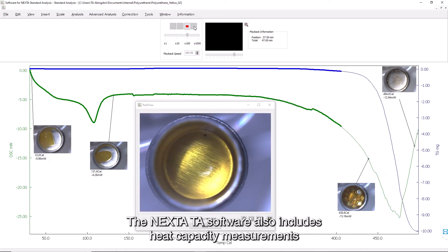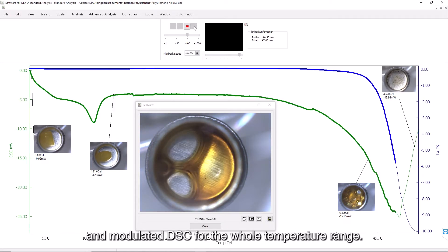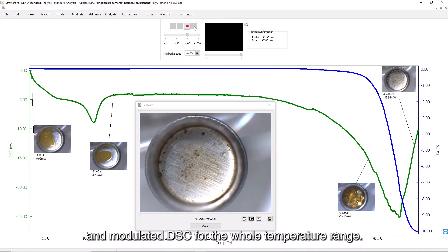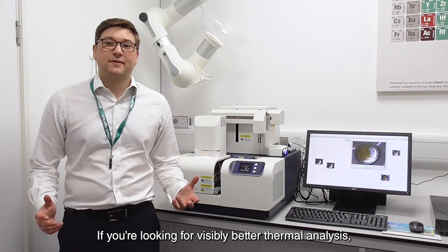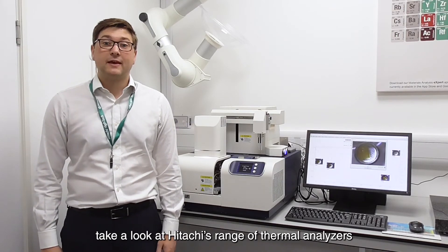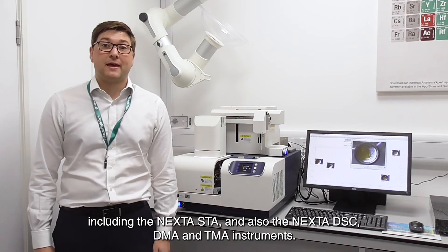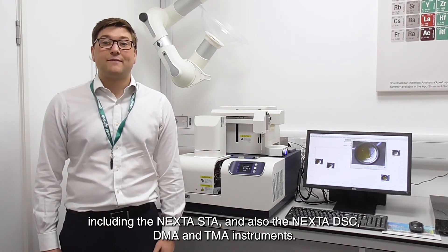The Nexter TA software also includes heat capacity measurements and modulated DSC for the whole temperature range. If you're looking for visibly better thermal analysis, take a look at Hitachi's range of thermal analysers, including the Nexter STA and also Nexter DSC, DMA and TMA instruments. If you want to know more, please contact us to schedule a demo.